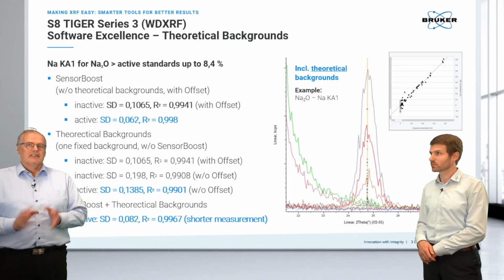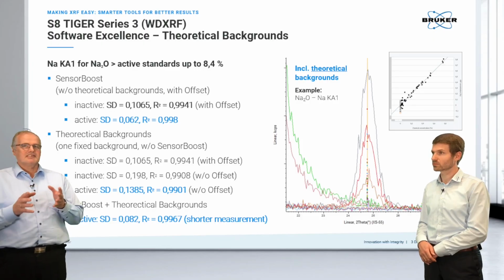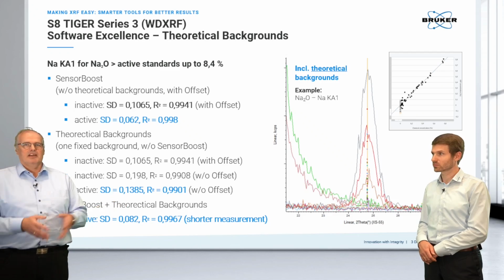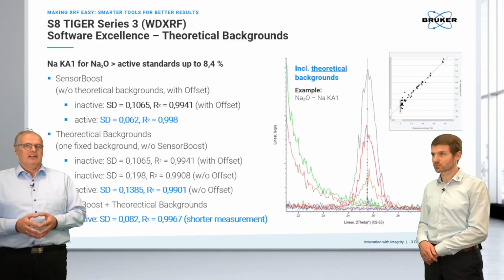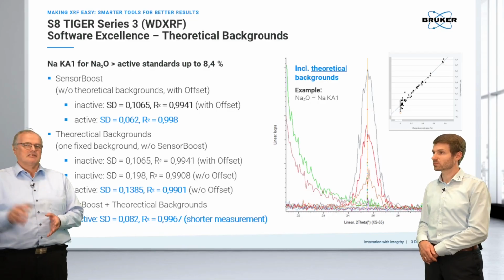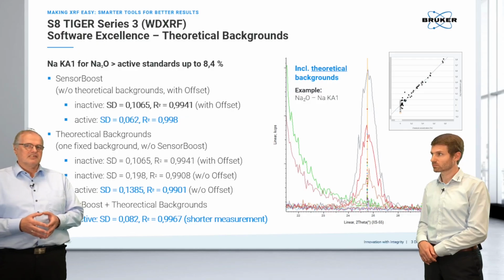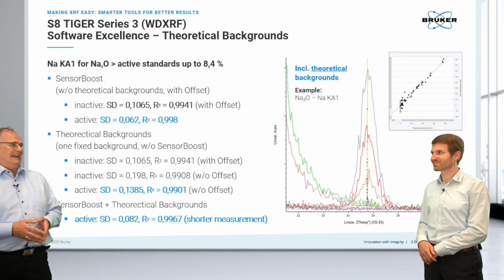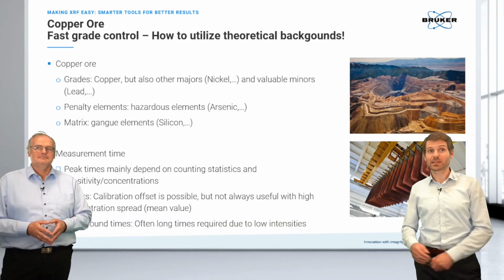And from my point of view, that's really impressive because this hasn't been done in XRF over the last decade. This is a completely new approach and really helps to enhance the signal processing. I would say this is something like going from the small television to 4K, right? Right, yeah.